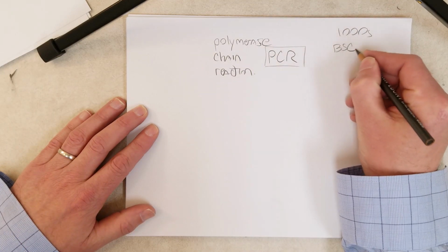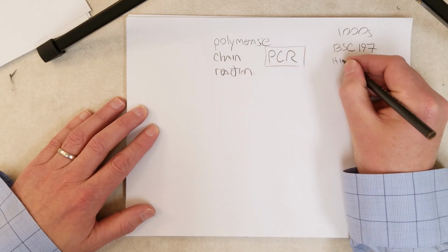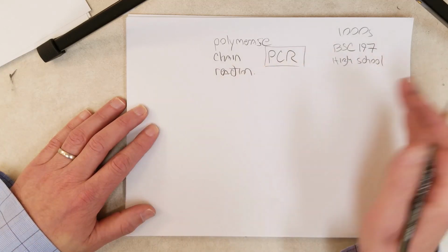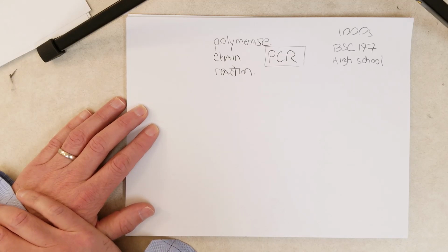And I know here at ISU, we cover this in BSC 197. And I know many of you probably even covered it in high school because it's such an important technique in genetics, but biology as a whole. PCR is really important. But I want to have a series of videos that cover all the important topics of genetics. So I will do a brief introduction into the polymerase chain reaction, and essentially, if you watch this video, you should understand conceptually how the polymerase chain reaction works and why we need certain temperatures and things like that.